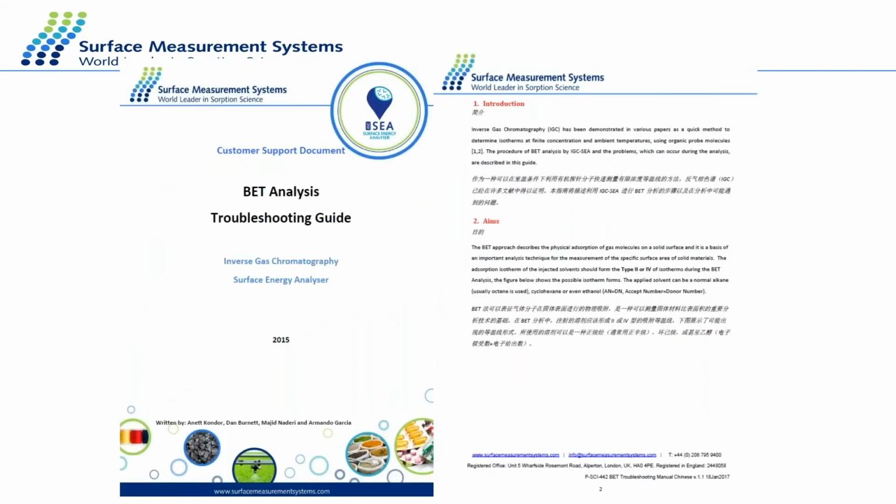We have a BET troubleshooting guide, and it's available also in Chinese. So if you contact us, or have this guide, it can help you to perform the BET experiment most accurately, and it's available also on our website. I recommend it if you just start BET analysis with IGC; this also contains a nice summary of the BET analysis.